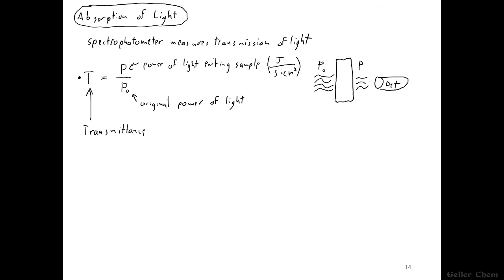We have the equation for it, but let's verbally define it. It's the fraction of light that passes through a sample. Fraction of light passing through a sample.